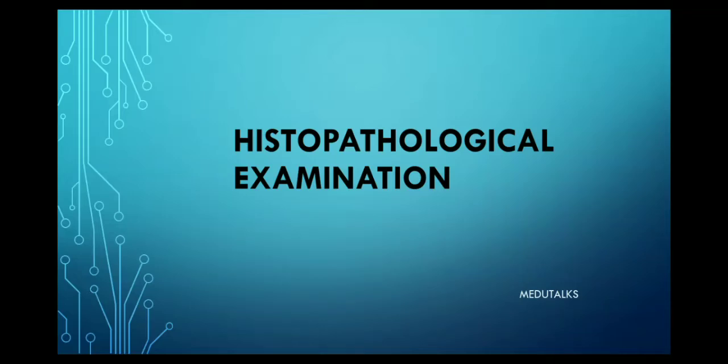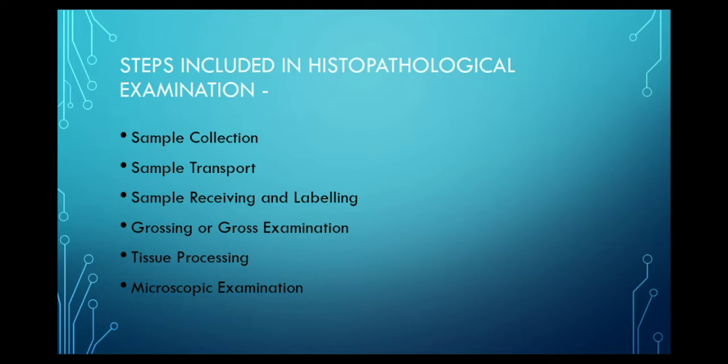Here we come with part 2 of histopathological examination. In this video, we are going to discuss the objectives or steps which are included in histopathological examination. So let's get started. Following are the steps included in histopathological examination.